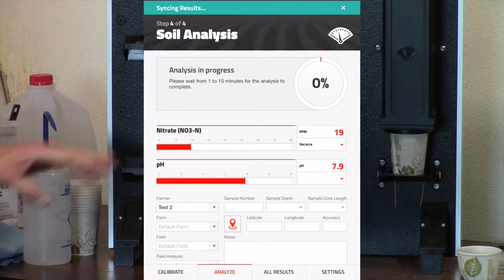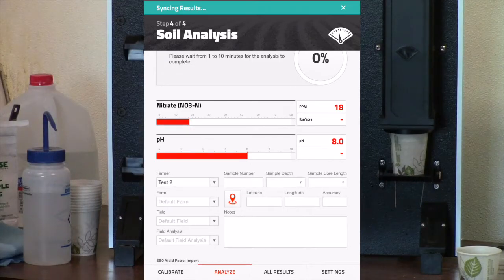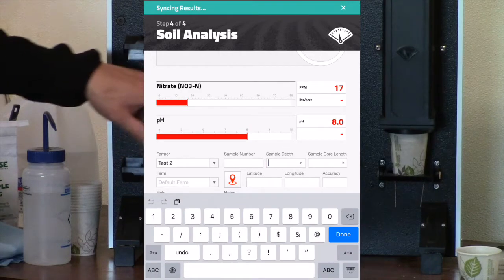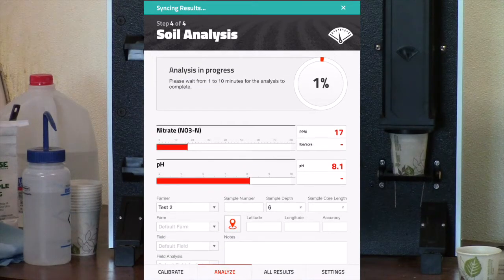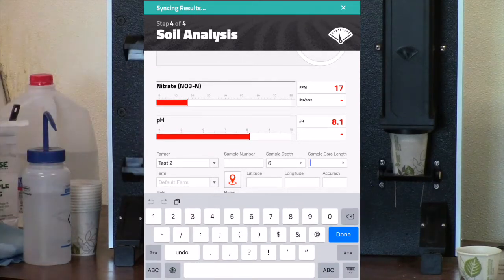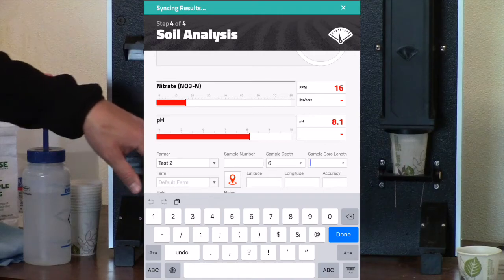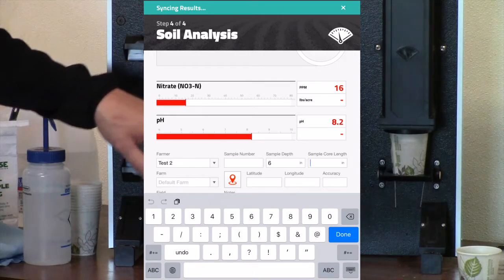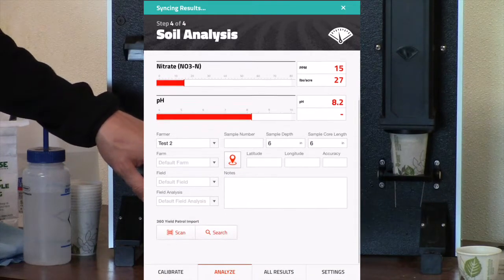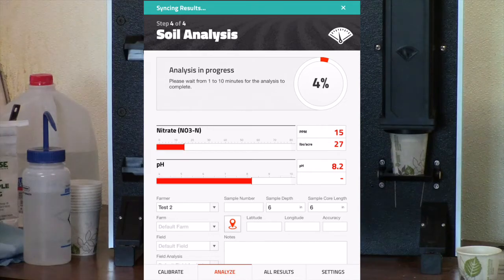At this point, the soil scan will give us a real-time reading of what the nitrate level is in the sample. And then we can also continue to enter in data information if we do not complete that during the mixing process. To get pounds per acre results, we need to enter in a sample core length and core depth. So in my instance, I'm going to put 6 inches in both. And after doing so, we will also get the addition of pounds per acre result.